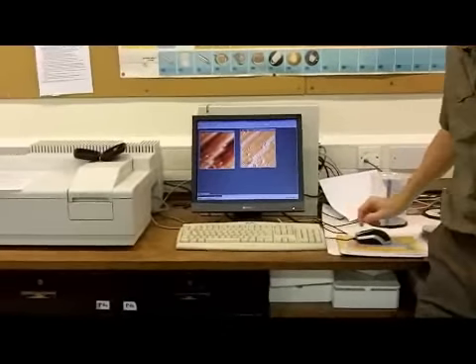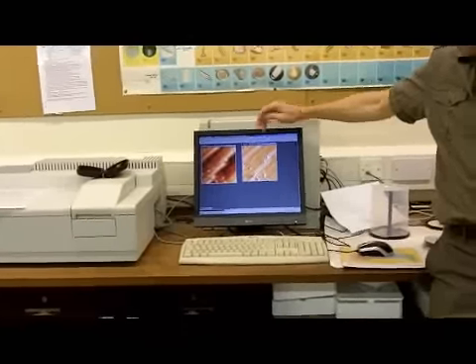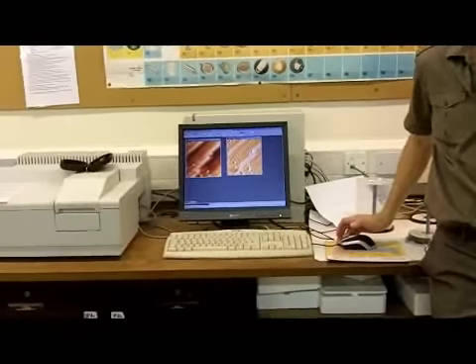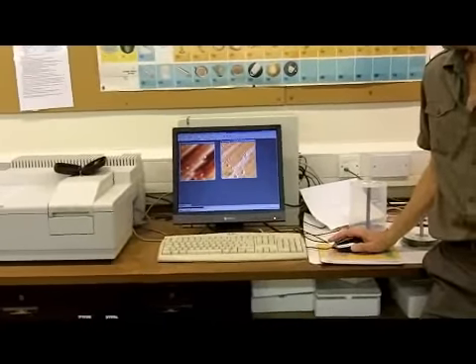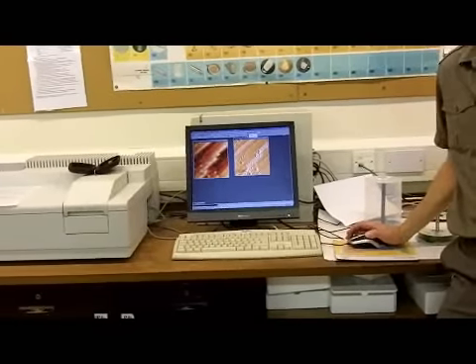Okay, right. So to do that, we need these toolbars up here, and you can see this little box that looks like a peak. It's called a profile. And the profile is how you're going to measure heights and distances. Now, if you click the arrow to the side of it, you'll see there are two types of profile.